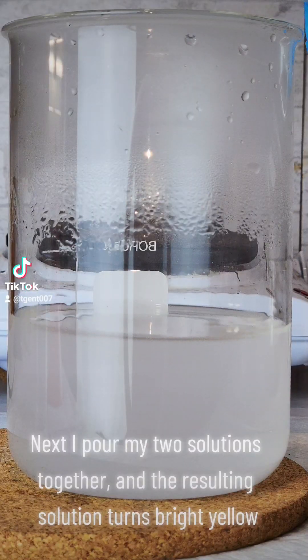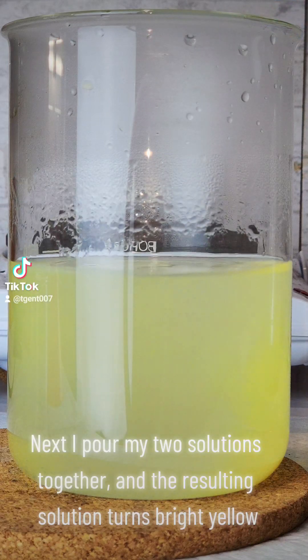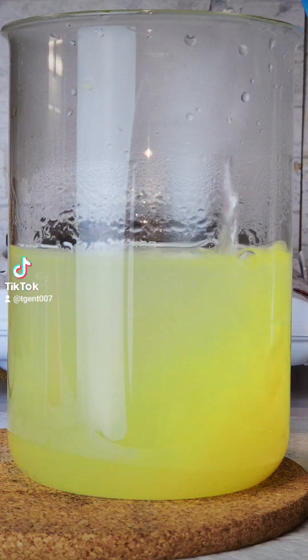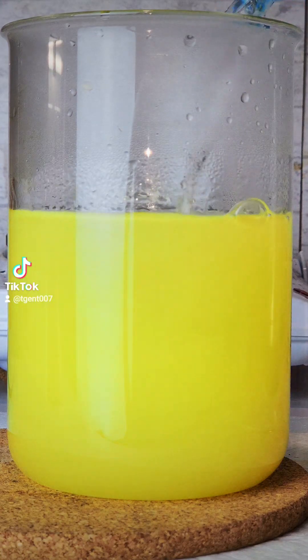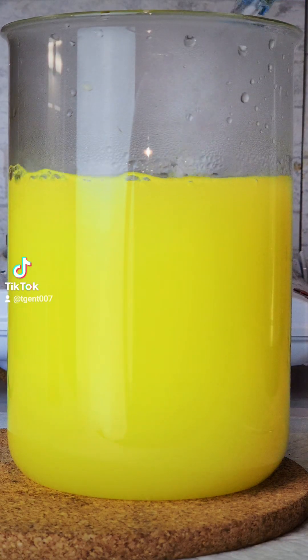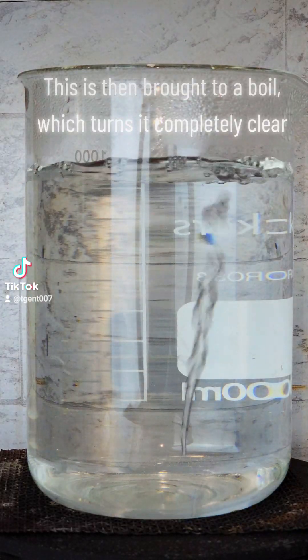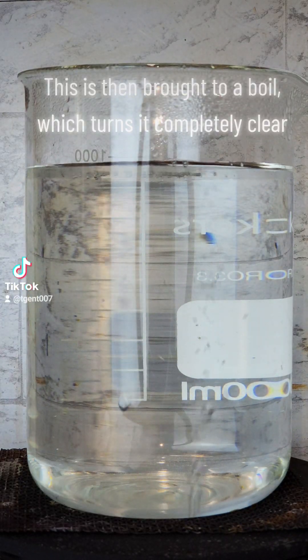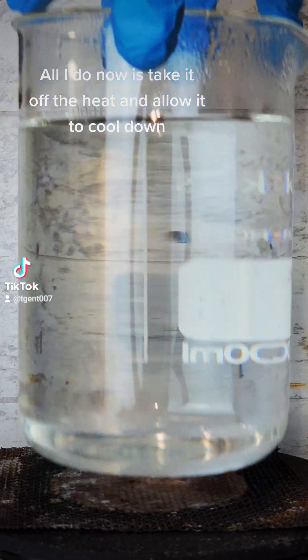Next I bring my two solutions together and the resulting solution turns bright yellow. This is then brought to a boil, which turns it completely clear. All I do now is take it off the heat and allow it to cool down.